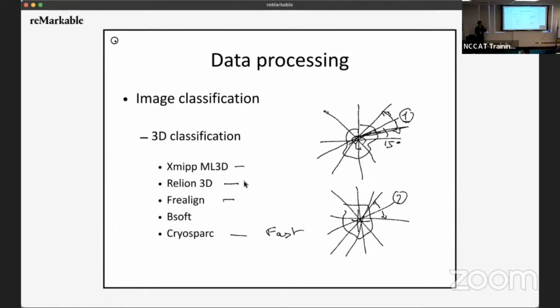It's because basically the program only searches those values and goes down by a factor of 2 each time. So you start at 15, then 7.5, then 3.75, and so on. It's just trying to fill the grid by a factor of 2 every time, so there's no specific reason for it.